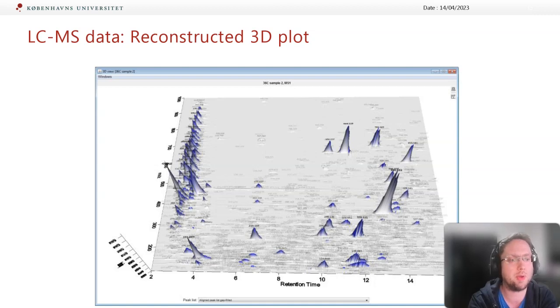What you also need to remember is that multiple peaks, or features, can originate from the same compound. That is because of the fragmentation and adduct formation mentioned earlier. For example, in this plot, I have marked 3 peaks that appear at the same retention time. Since they appear at the same retention time, it is plausible that they originate from the same compound, and we thus have 3 features that represent the same thing.